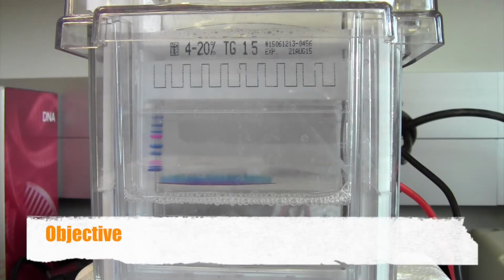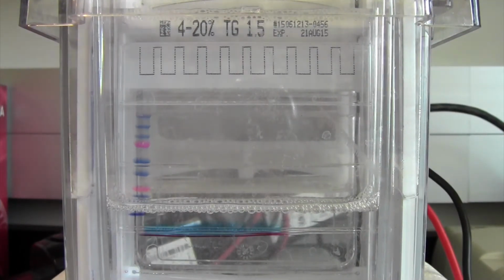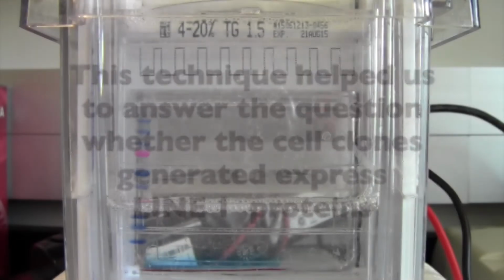My objective is to force expression of line 1 proteins in non-malignant cells to test if line 1 protein transforms cells to malignant cells. This technique helped us to answer the question whether the cell clones generated express line 1 proteins.